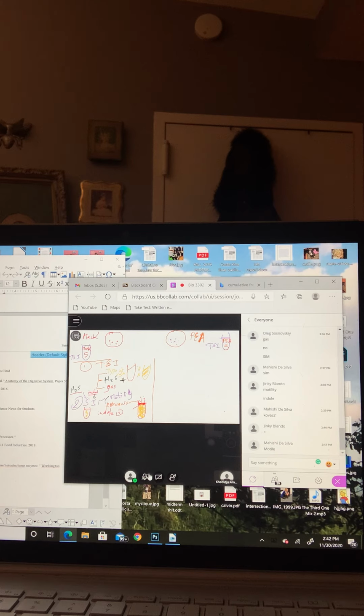It's the same for H2S production: either all the tube is black, or it is restricted to the line of inoculation. So this is what you get from the SIM tube test.